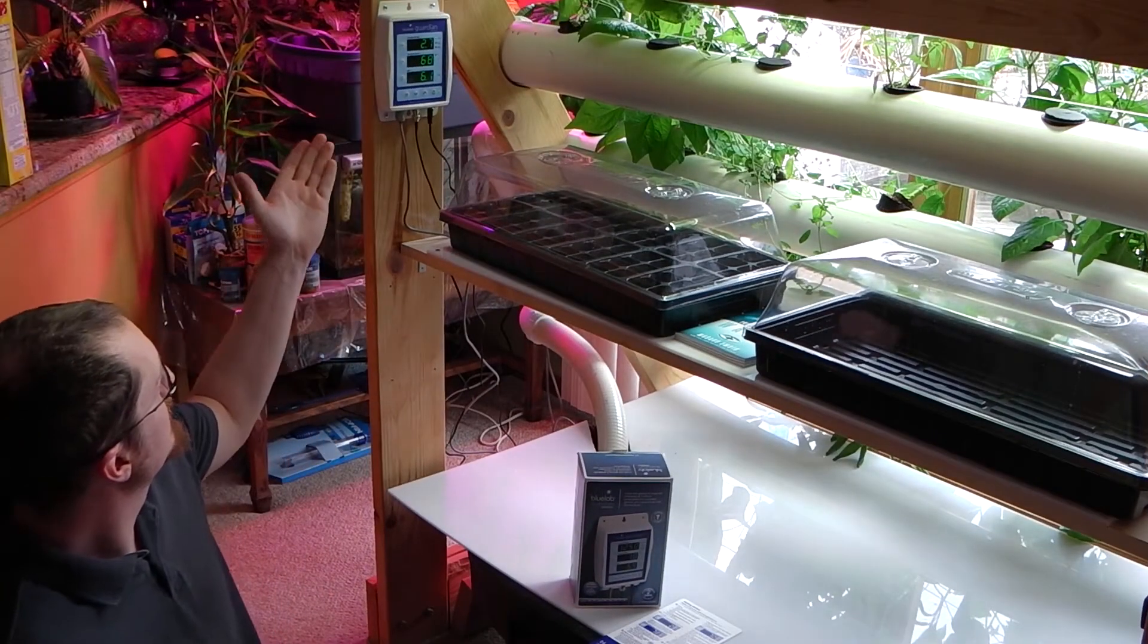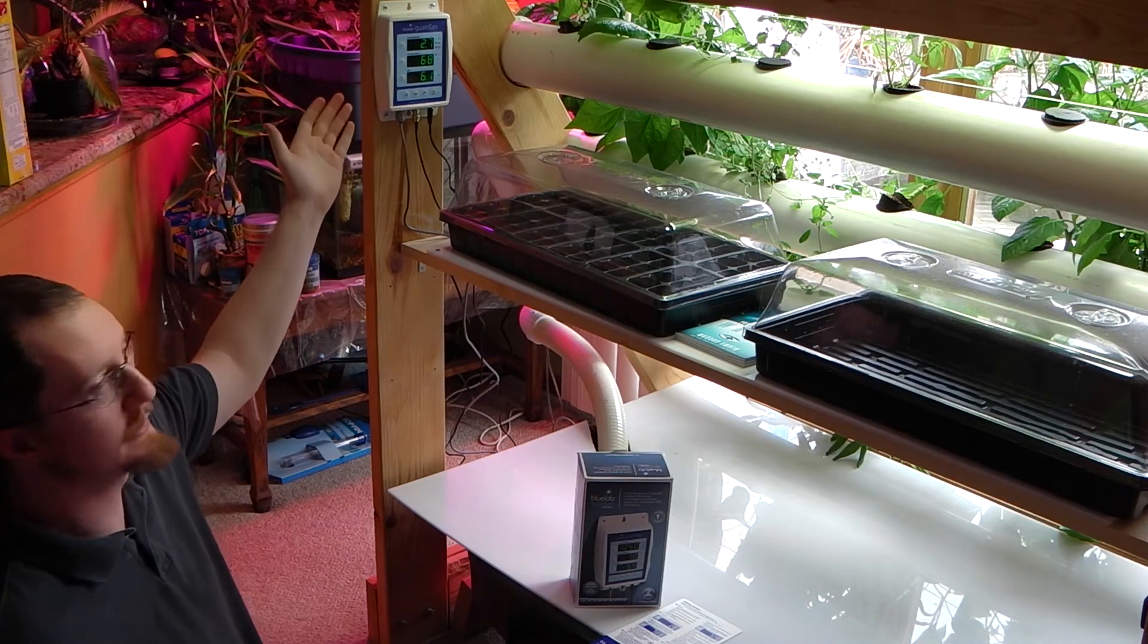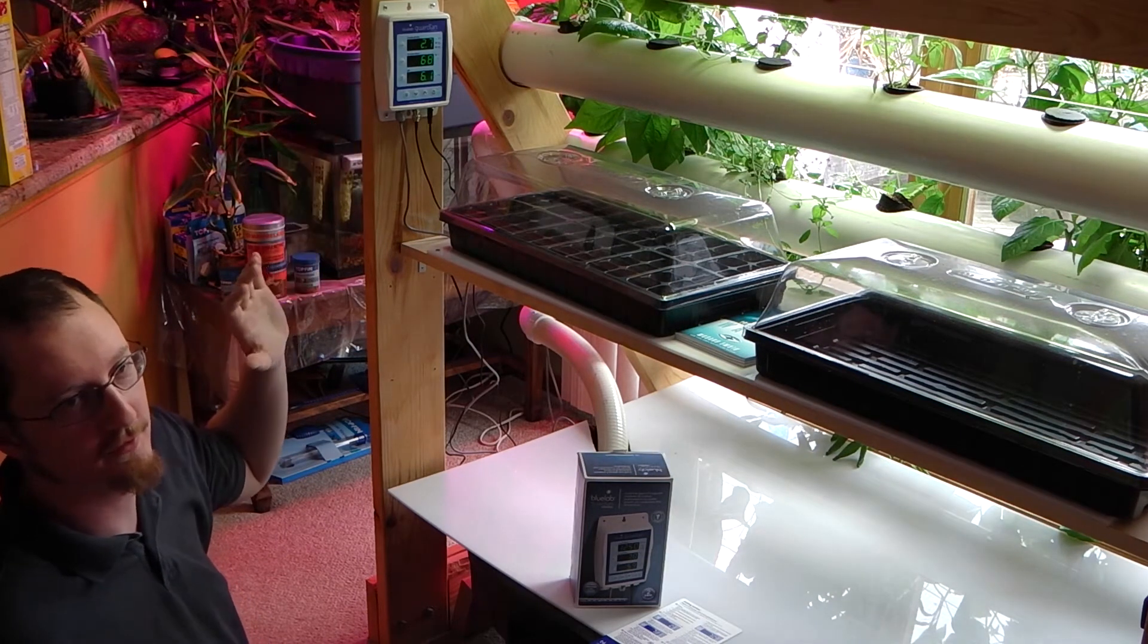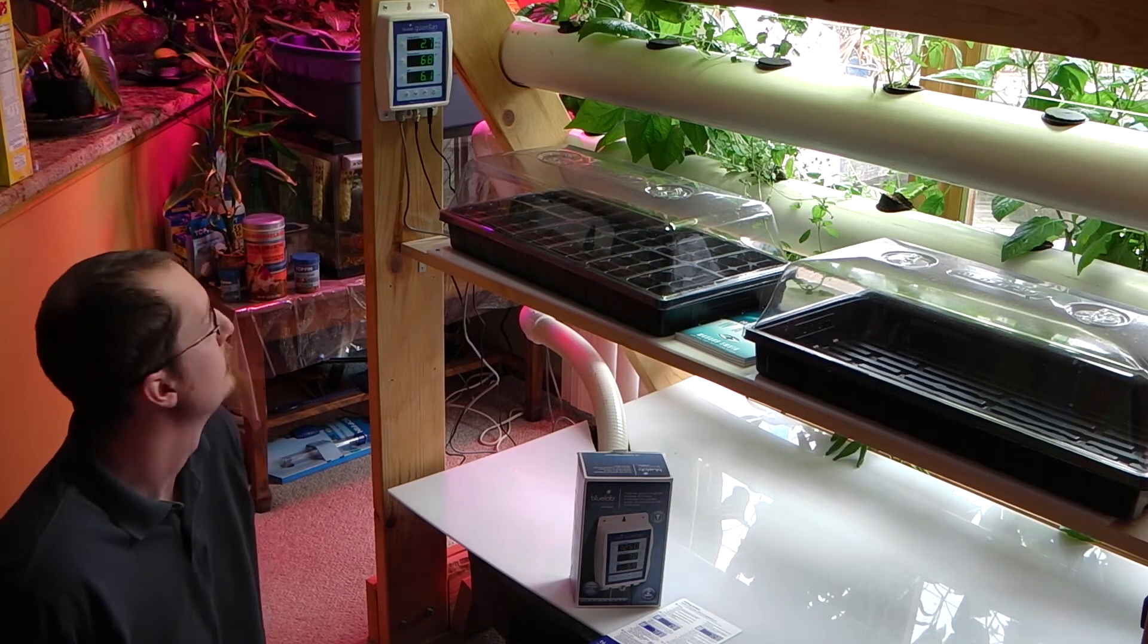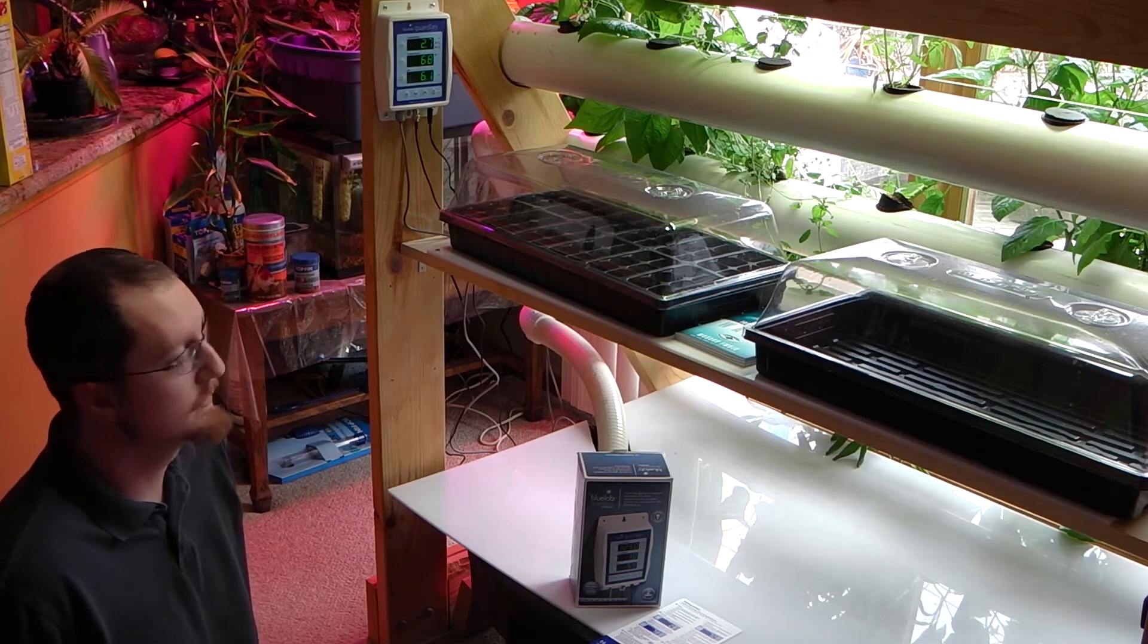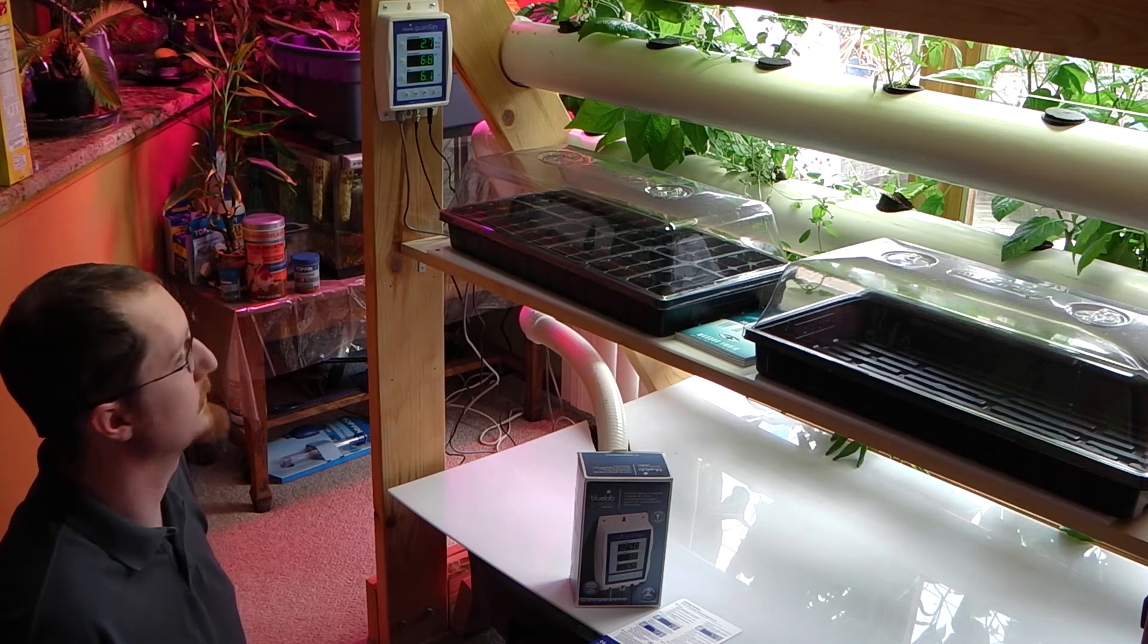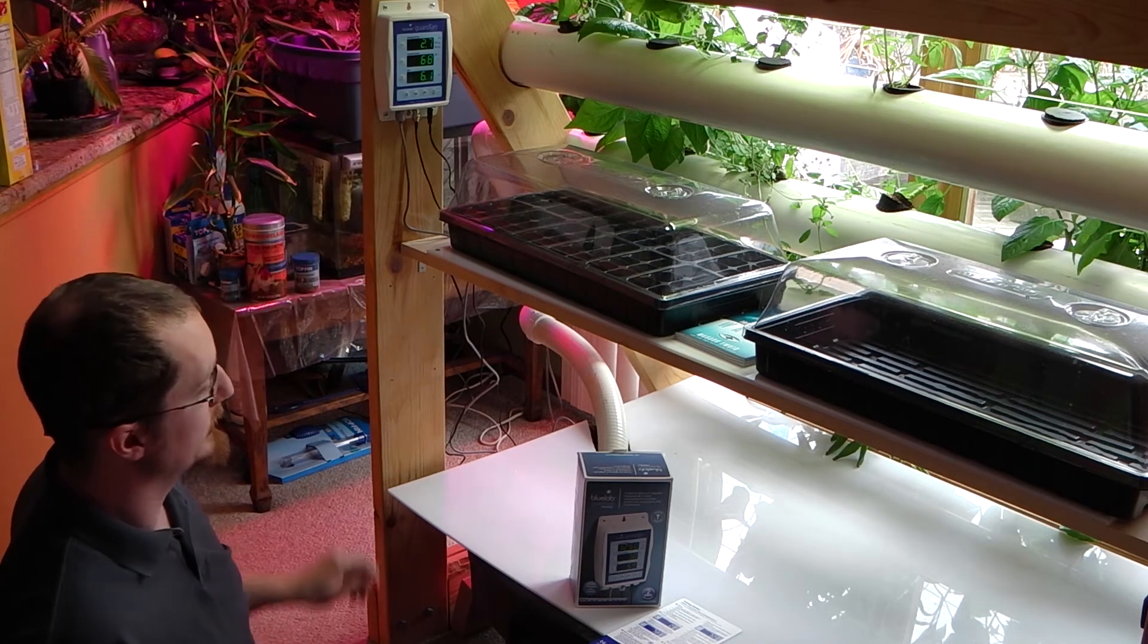Okay, so you may notice the BlueLab Guardian is now mounted up here, and this is actually a brand new, completely different unit from the beginning of the video. The one I ordered before I got off the internet, and it must have been a completely defective unit. So I had to take that back and went to my local shop and picked this guy up.